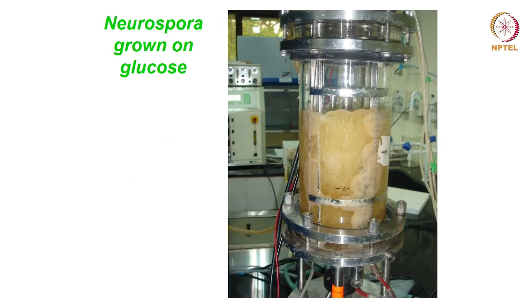If you see the picture here, it is a filamentous fungi — Neurospora — grown on glucose. You can see how much wall growth there is; it adheres to the stainless steel parts of the reactor. You can see the film adhered to the baffles; nothing else is visible.